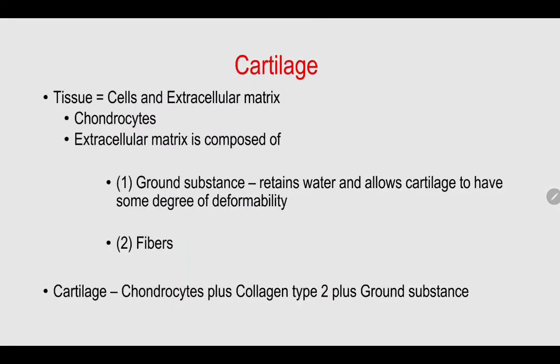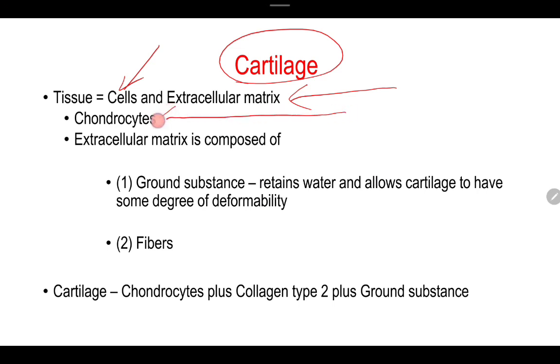For our next topic, we're going to talk about cartilage. Since cartilage is a tissue, it is composed of multiple cells and an extracellular matrix. Kasi, diba, yan man ang ng tissue talaga. So, here, ang cells found in the cartilage is what we call a chondrocyte, no? In comparison sa ating previous na mga connective tissue na ang present is the fibroblast. But here we have the chondrocyte.